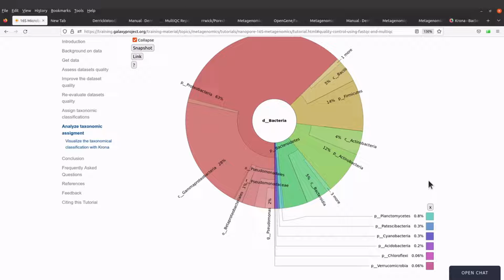When I say that, I mean you need to have an idea of factors that are necessary for the organism's survival, growth and reproduction. You also need to factor in factors that are responsible for inhibiting the organism's growth or factors that are responsible for killing the organisms.